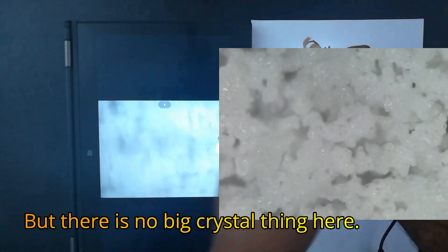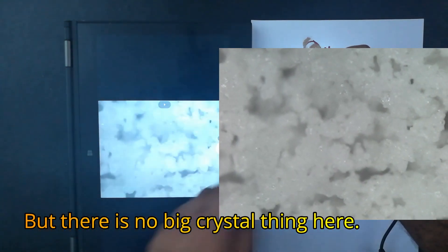Because I just put this thing before this video. I put it in a few of the other whey proteins that I got. And this is exactly how the structure is. Which is predominant in case of... Now, again, see here. There is this some crystal type of thing. I found it everywhere. I searched the internet. I didn't find what I'm talking about this one. I searched the internet. And I never found that nobody's saying that there should be any crystal or light reflecting, too much light reflecting stuff in any of the whey protein if it's pure.